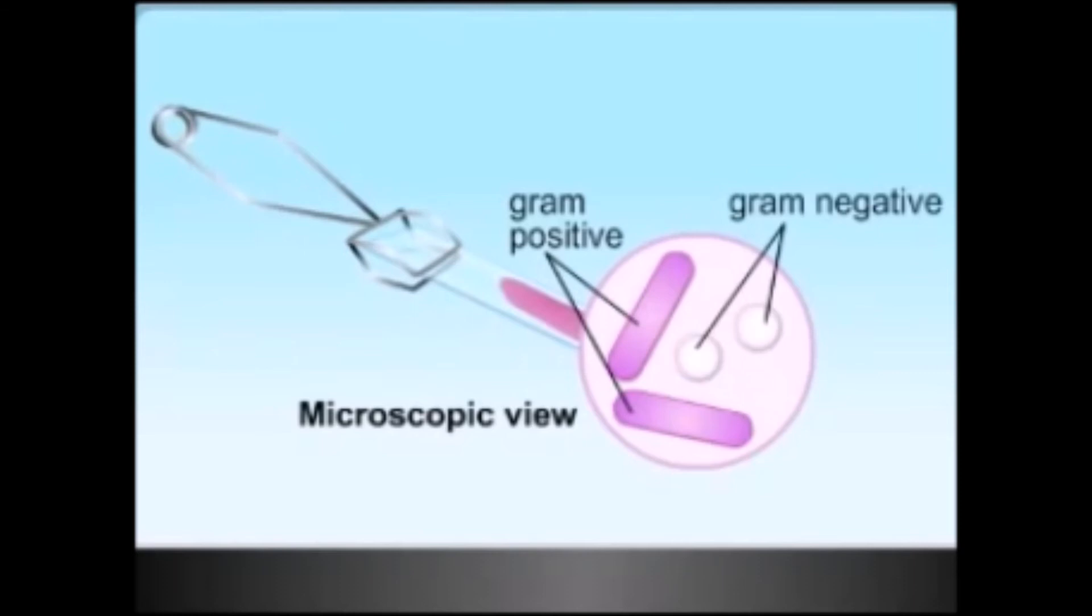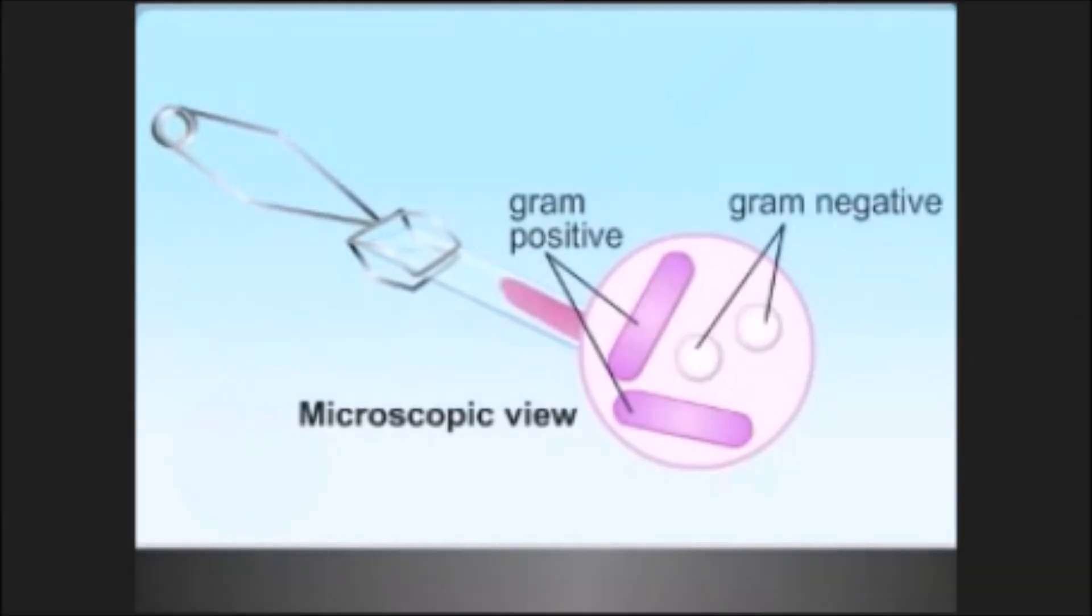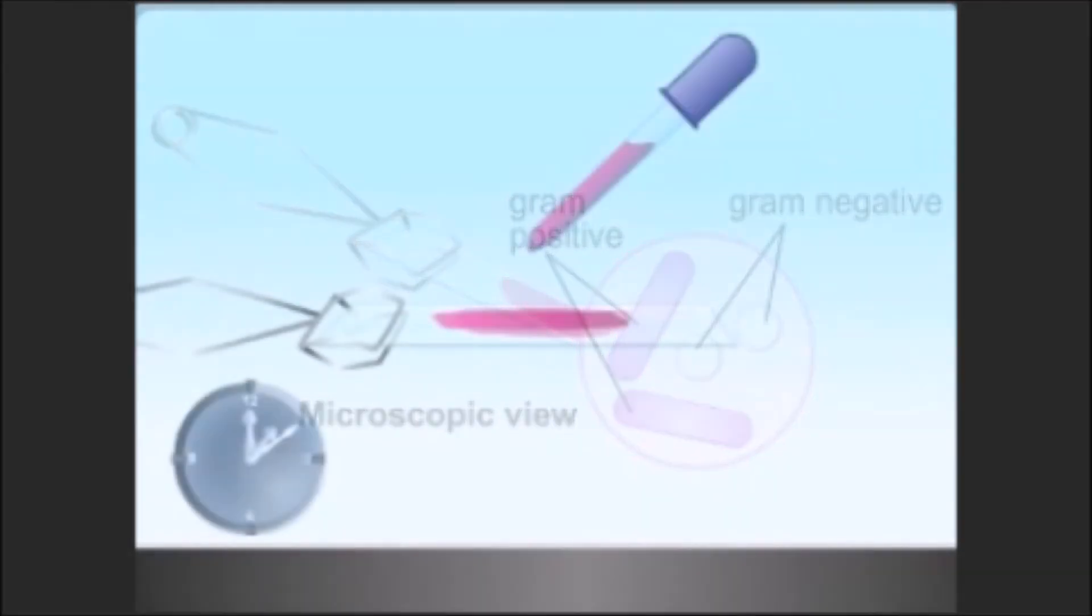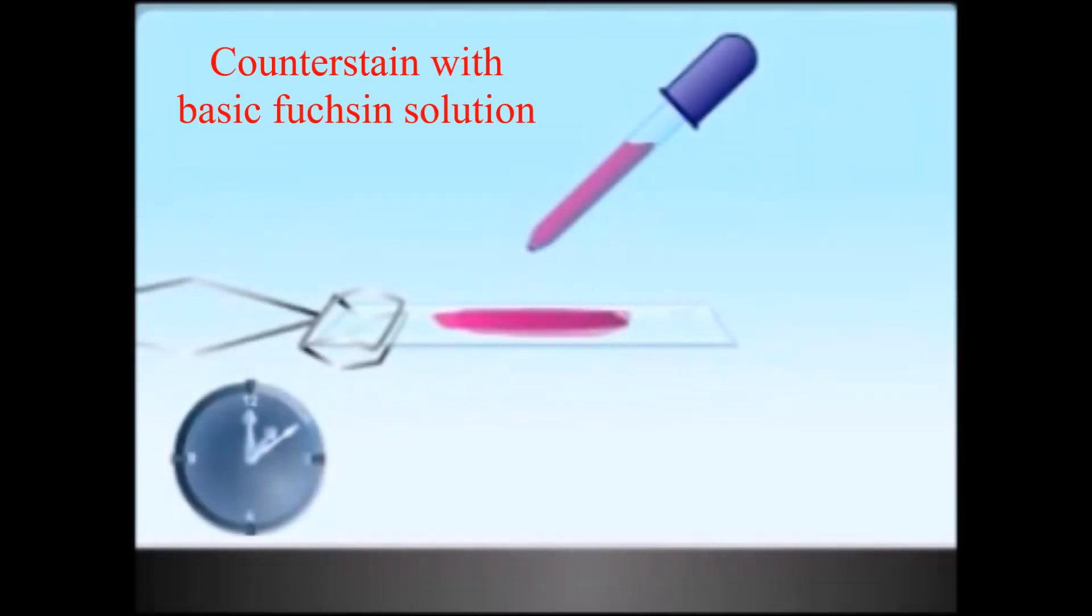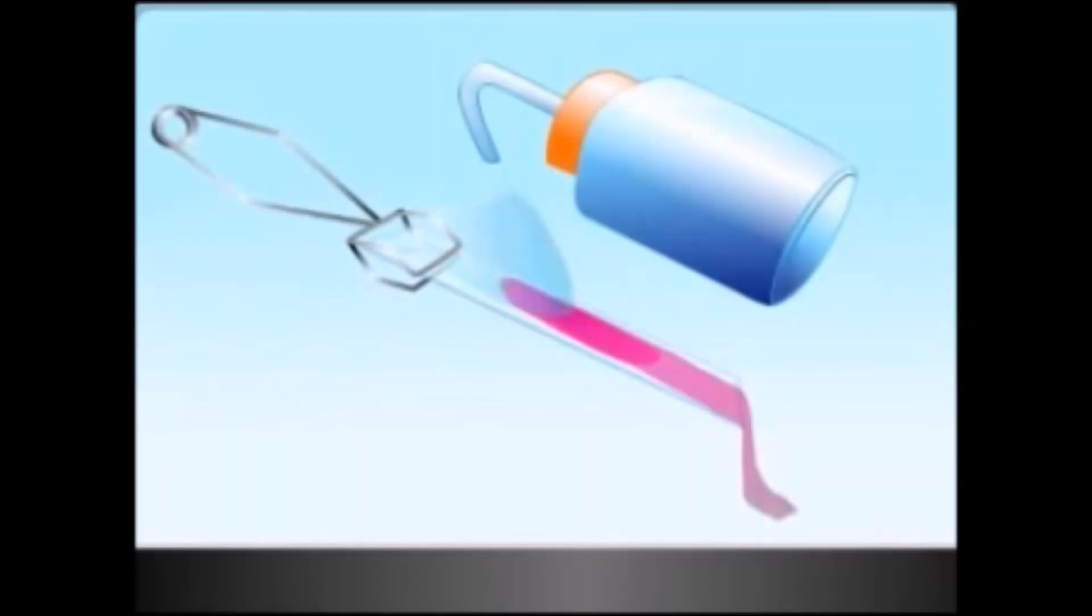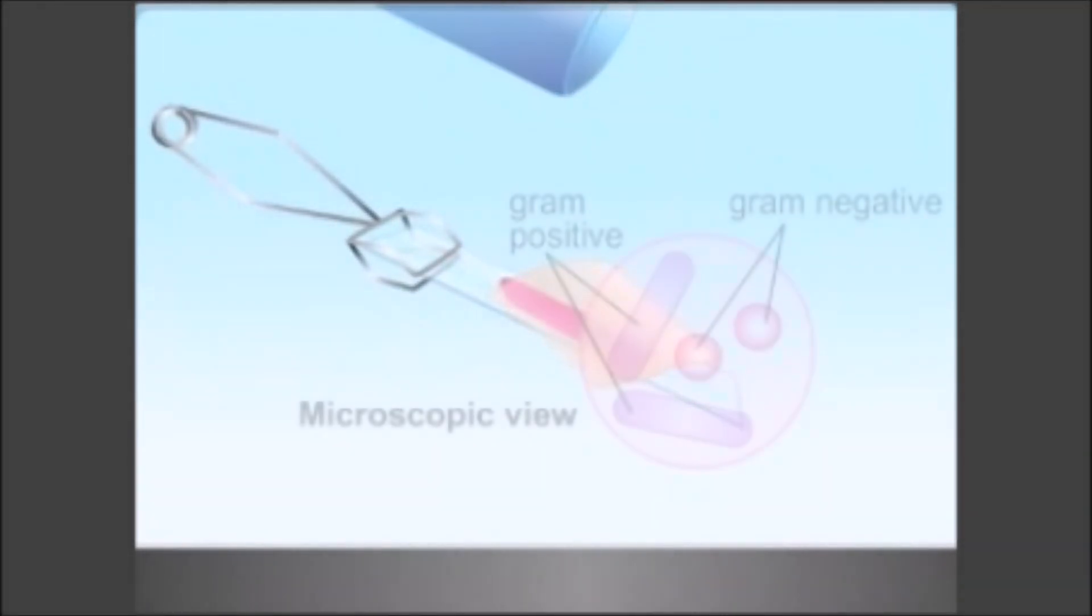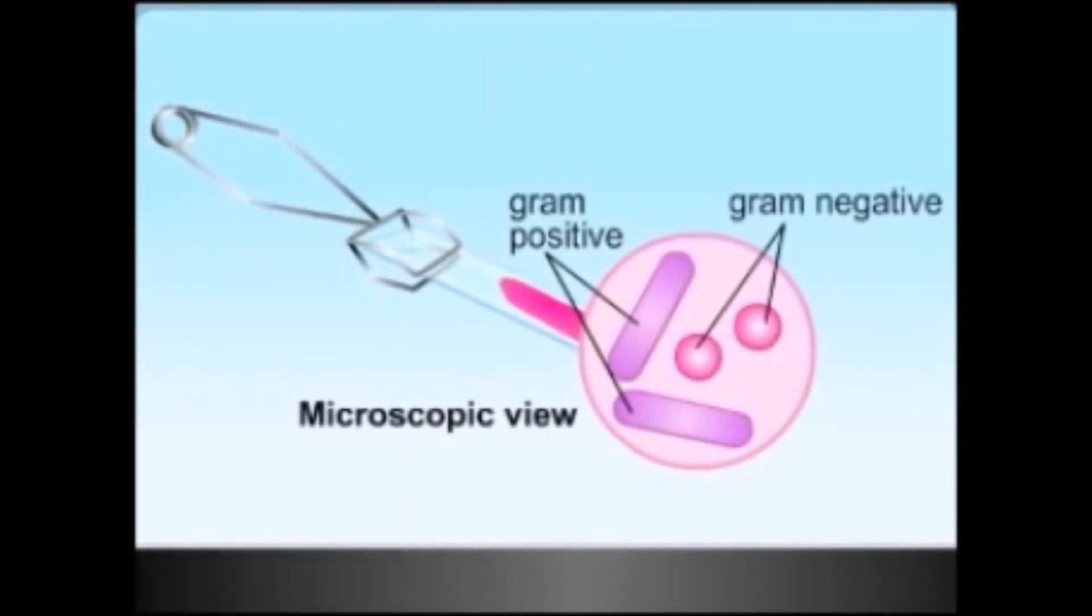Counter stain with basic fuchsin solution for 40 to 60 seconds. Wash off the solution with water and blot with bibulous paper to remove the excess water. Alternatively, the slide may be shaken to remove most of the water and air dried. After this treatment, gram positive shows violet color while gram negative bacteria show pink or red color in microscopic view.